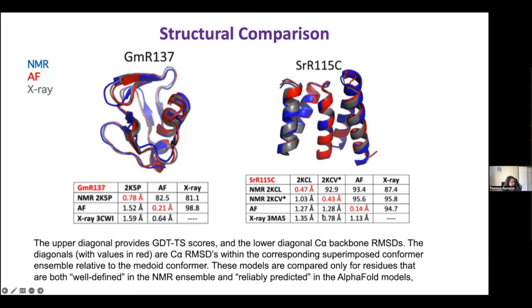And then if you look at RMSD, you can also see that this NMR structure refined with RDCs, 0.78 angstrom, had a very good RMSD with the X-ray structure. So most people know that adding additional restraints and adding the NH RDC data will make your structures better. And this shows that it makes them more accurate.